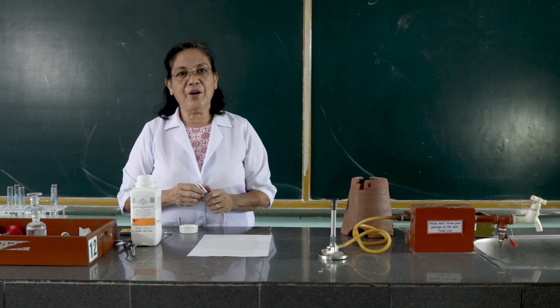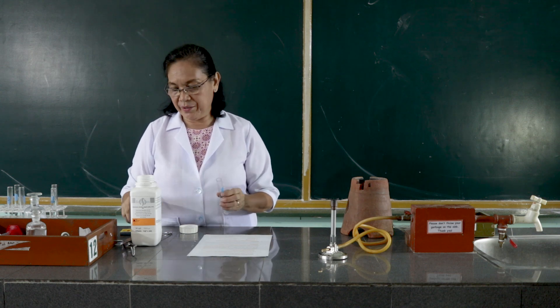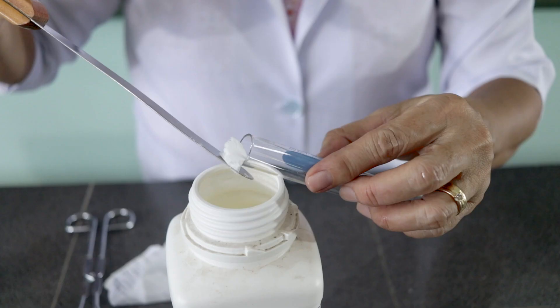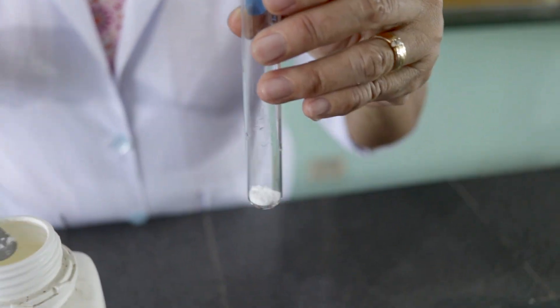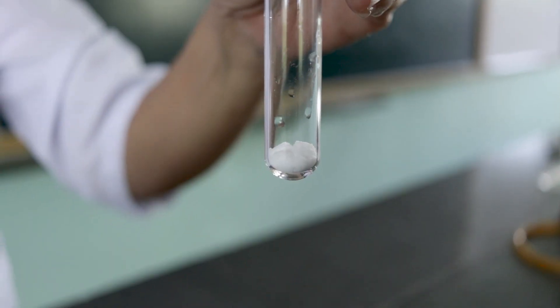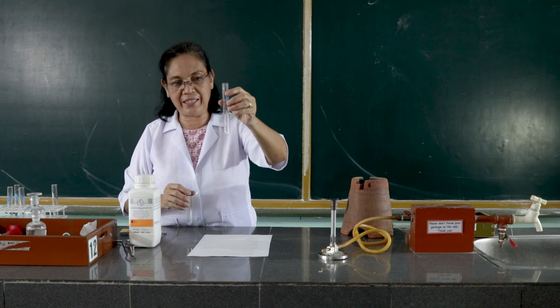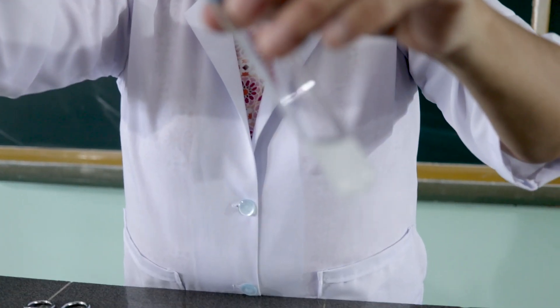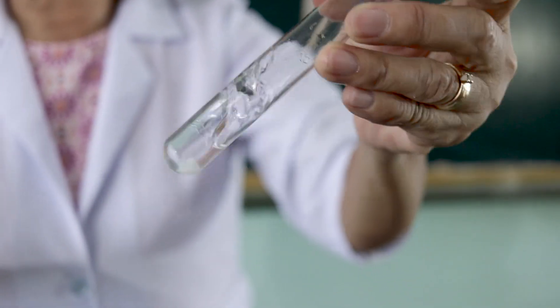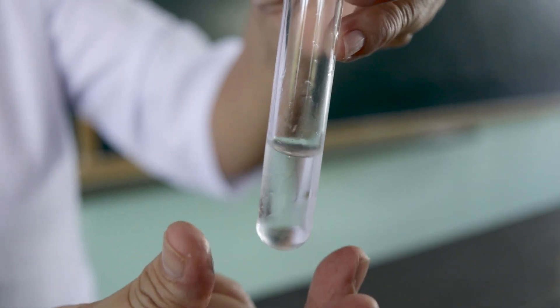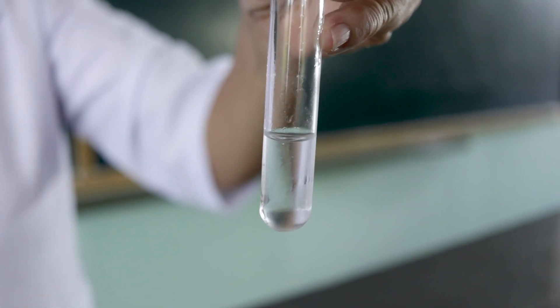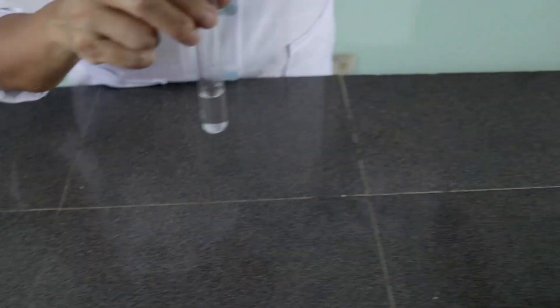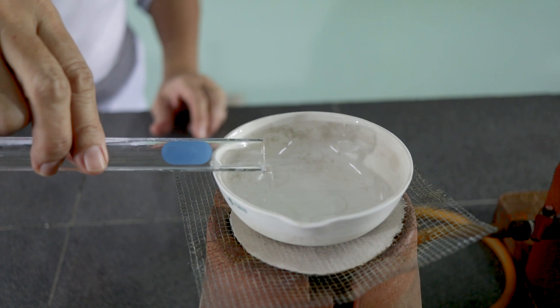In procedure number five, we are asked to dissolve the ammonium chloride crystals in water. Let's get some amount of the ammonium chloride crystals. Observe its color and state. Then we are going to add water into these ammonium chloride crystals and observe what happens. Then we are going to evaporate this to dryness and observe what happens.